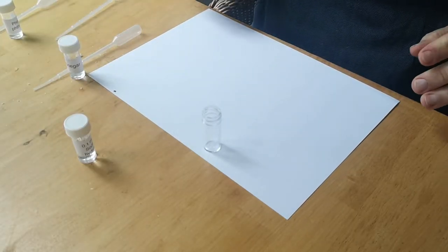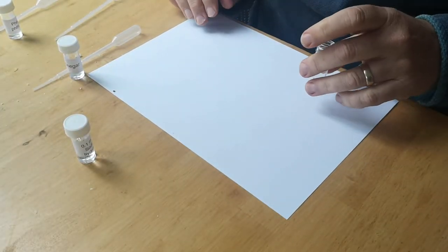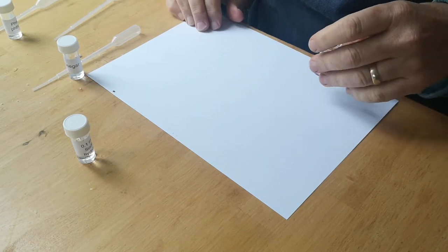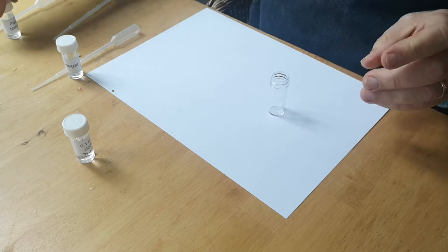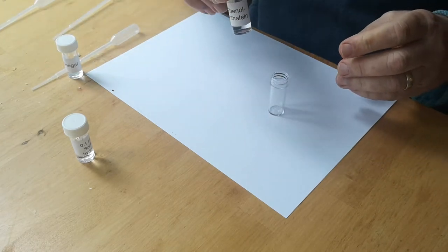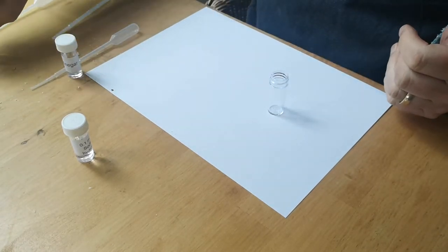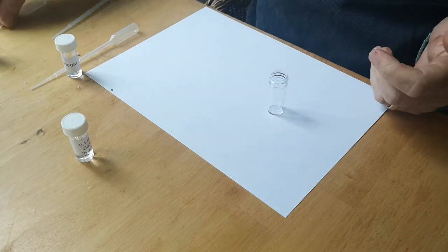Right, so welcome back to experiment 2. What you're going to need for this is the contents of pack 2, but also from experiment 1 you will need the phenolphthalein indicator and a plaster pipette.